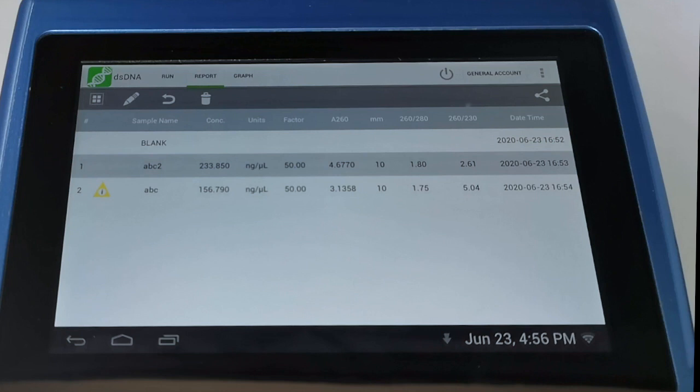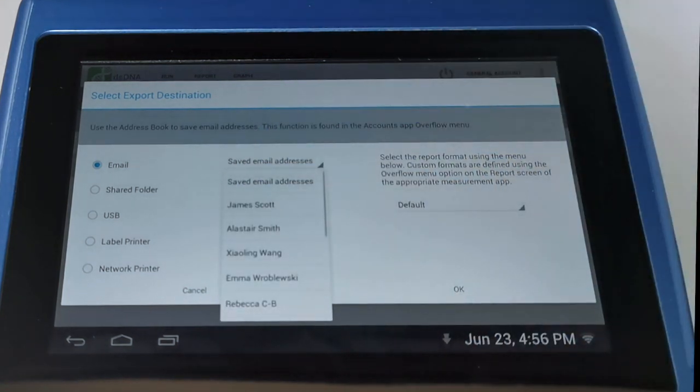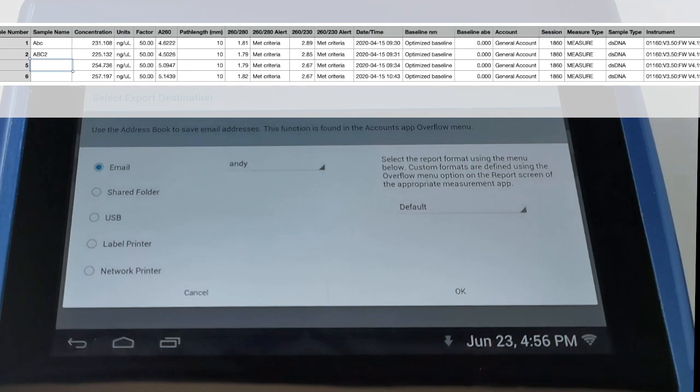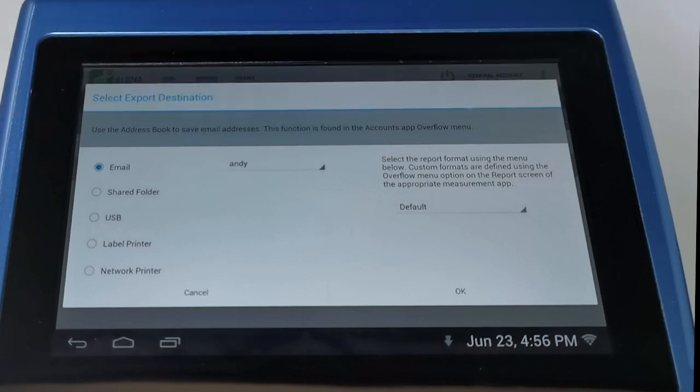In the table we see concentration, units, and purity ratio information. We can select samples and use the share button to bring up the export menu. As mentioned, the DS11 can be fully networked — we can set up its own email address, save recipient addresses, click OK, and it will automatically generate a report and send a CSV file you can open in Excel. Alternatively, we can save to a shared network folder, save to USB, print to a label printer, or send to a network printer.